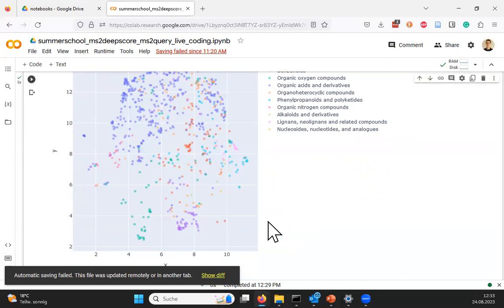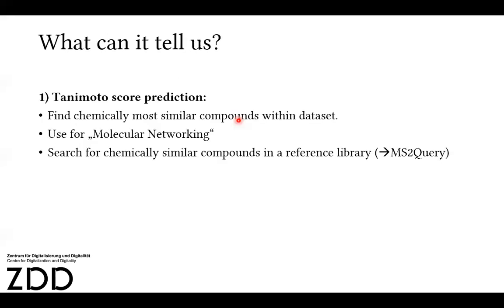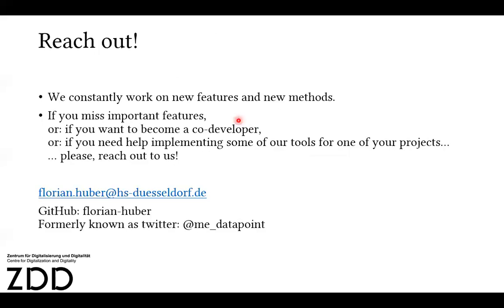Is there any question? I shared the notebooks, they are all in the solution part, so you could hopefully also rerun them and modify them later on if you like. There's just this last slide here.